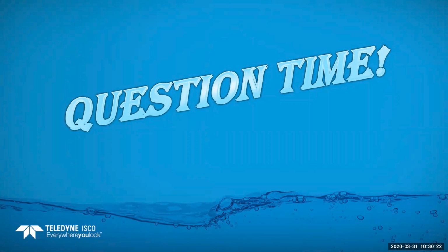See one here: do you consider supplying the 5800 with battery and solar panel? Nope, that's what I said in the presentation early on. You do not want to run a 5800 off of that. Any type of refrigerated sampler like that draws way too much current, and you're just going to drain your batteries.